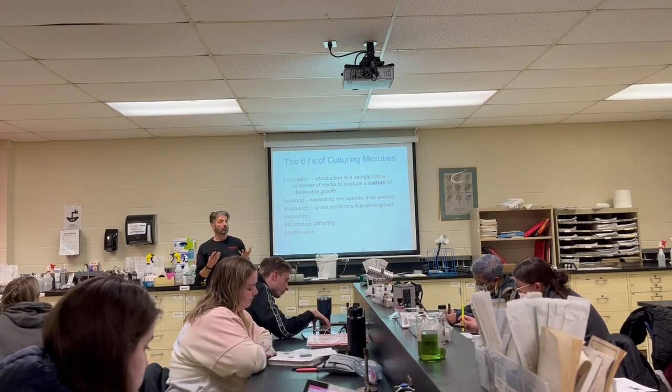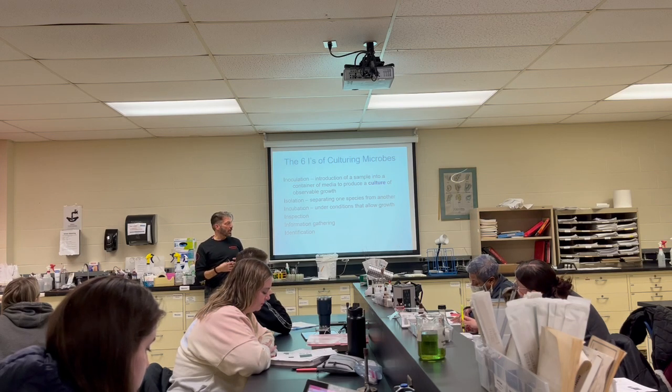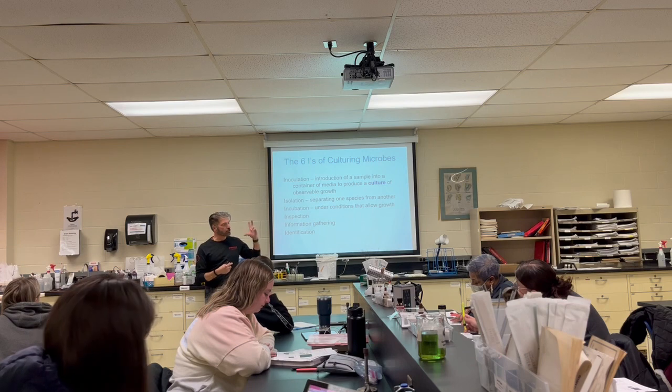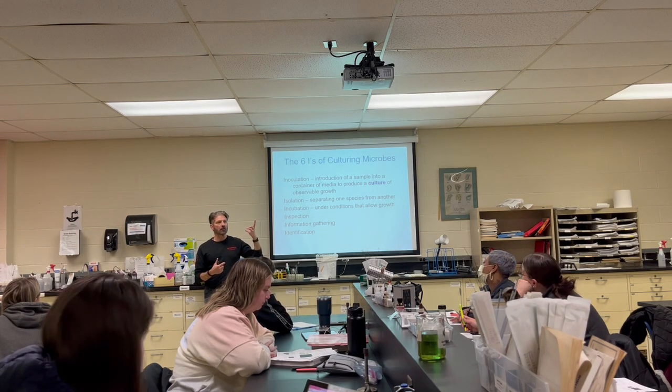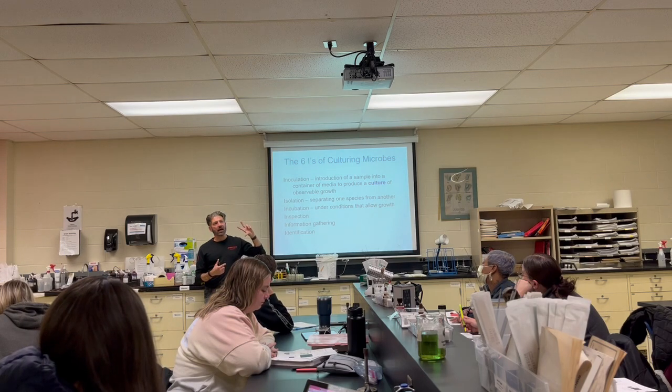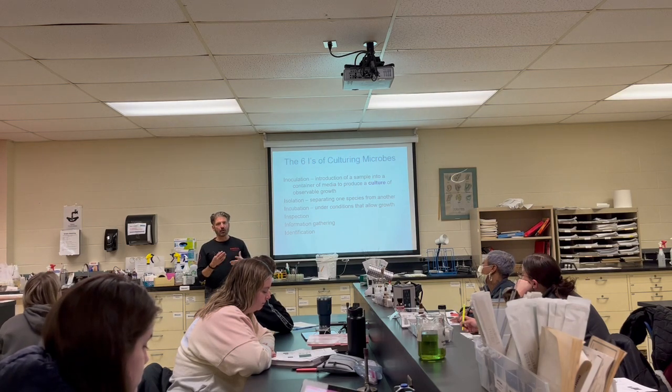In a minute, I'm going to grab a bunch of tubes and everything. And please realize if I have a nutrient broth and it's clear, and something is growing in it a week later, should I expect that the viscosity or the color of that tube will probably change? Yes, it's going to get a little bit murky.